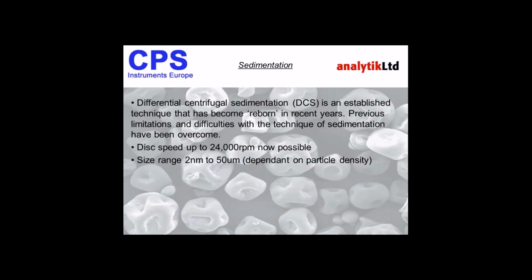So let's now move on to talk about differential centrifugal sedimentation, and I'm going to use DCS from this point onwards. Differential centrifugal sedimentation is certainly a mouthful, and I always struggle saying that. DCS is a novel and innovative yet simple technique which has become reborn in recent years. Previous limitations and difficulties with the technique have been overcome using recent advances in technology and some smart thinking regarding instrumentation and disc design.